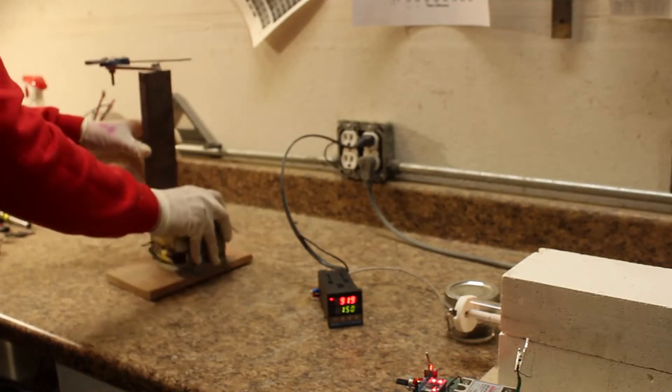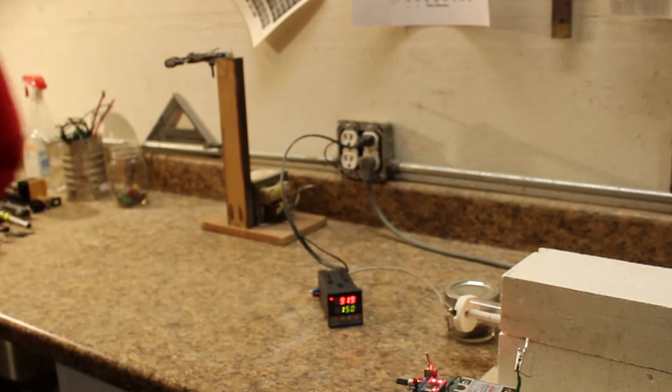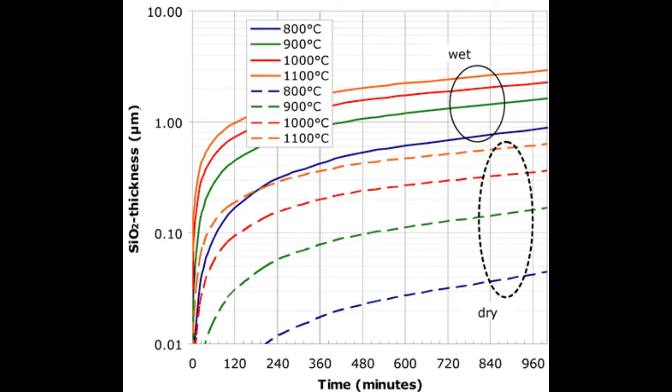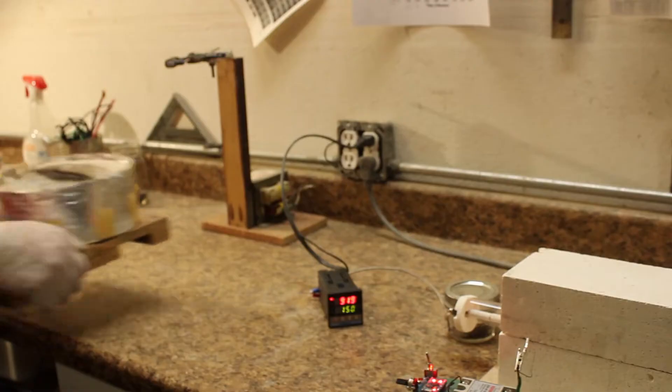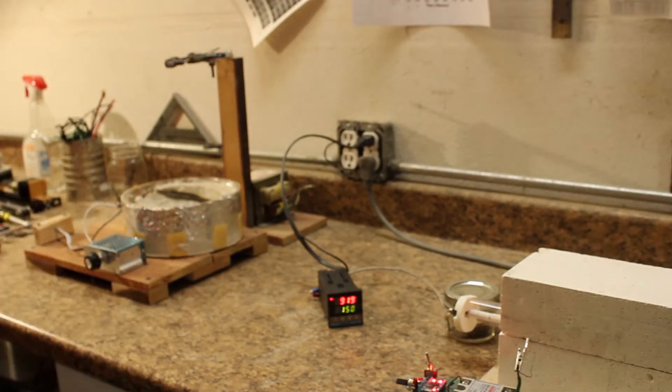To grow an oxide on a silicon piece we have to heat it, but the oxide growth is very slow this way. To accelerate it we pump steam over the silicon. So I set up an apparatus out of some glassware on a heating mantle. The steam will then flow through a piece of vinyl tubing.